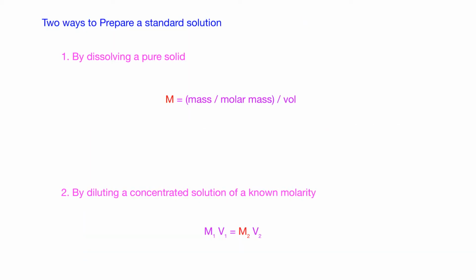So, two ways to prepare a standard solution. Remember, standard solution means that the molarity is accurately known. So we have to know the molarity of the solutions accurately. There are two ways to do that. The first one is by dissolving a pure solid.